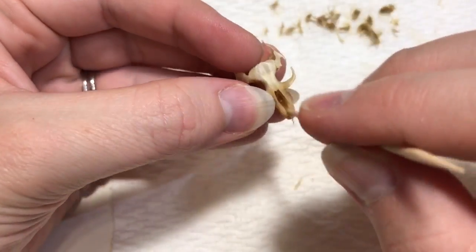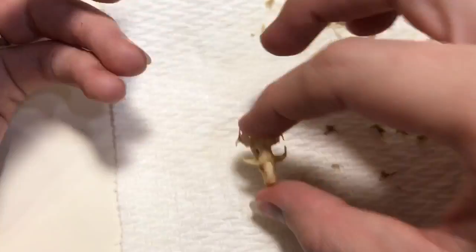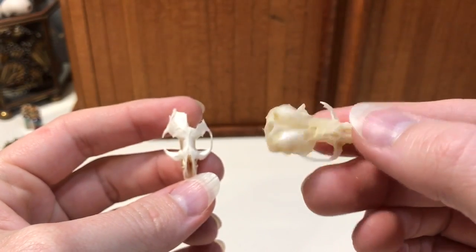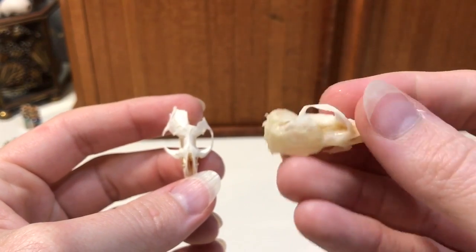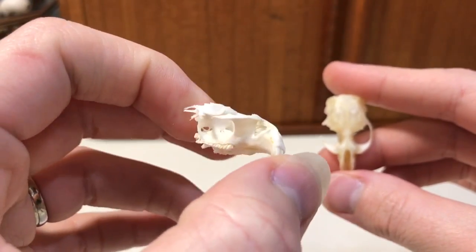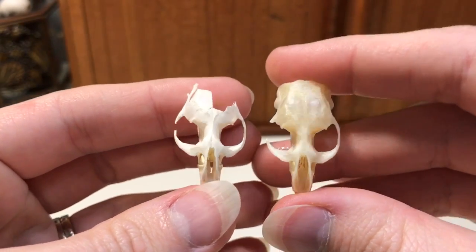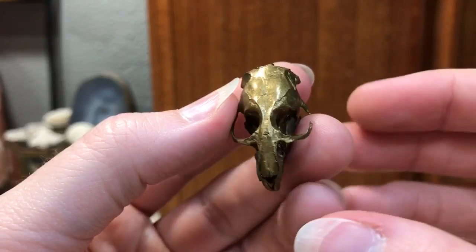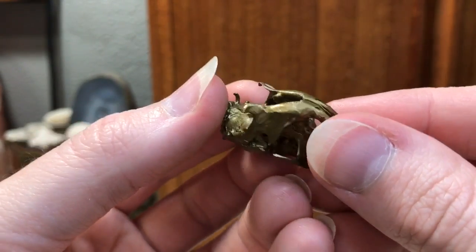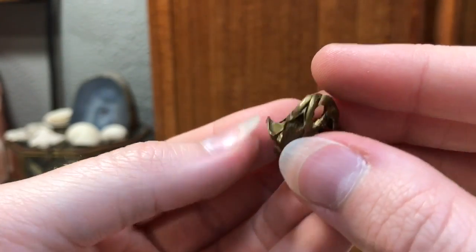The bones will look yellow when they come out of the water, so don't be discouraged — they are fairly clean. They're going to have a little yellow tint, but once the air gets to them and they dry fully, they're going to be a lot whiter. It's going to take some time for them to dry. This is one of the ones that I've painted and you can kind of see the final product. Let me know if you have any questions in the comments below.